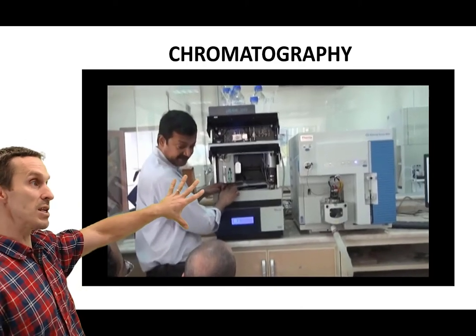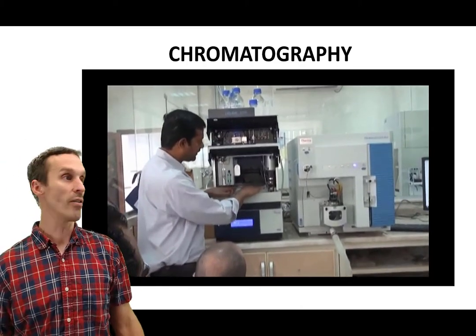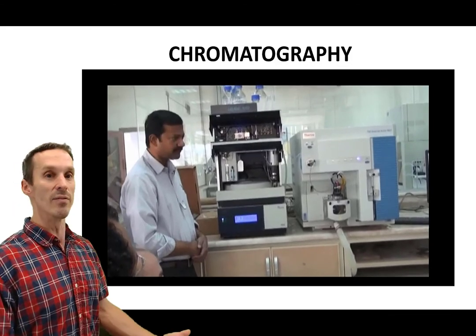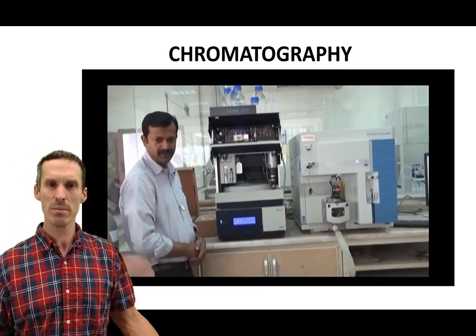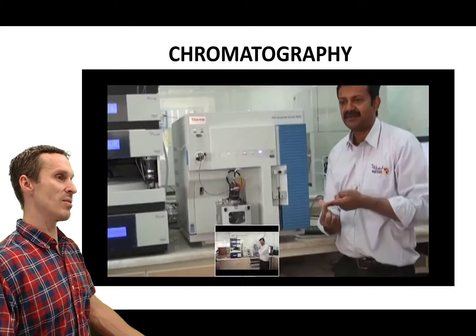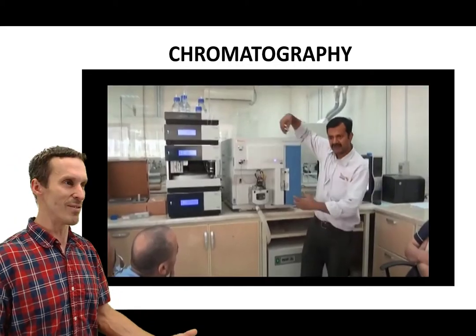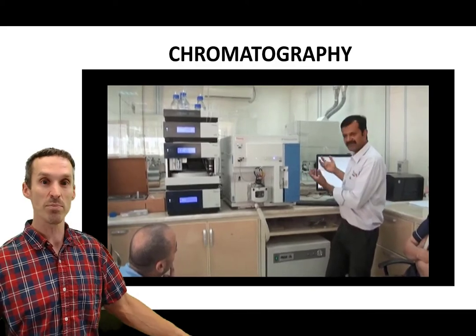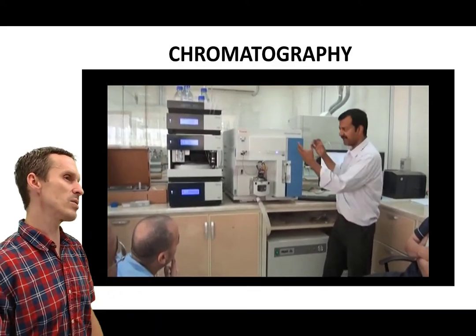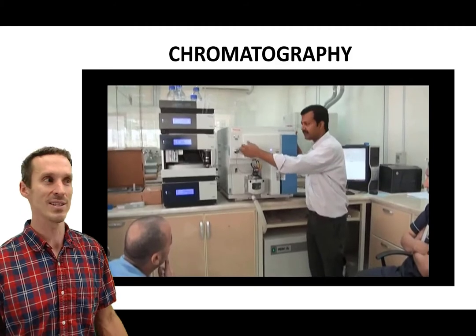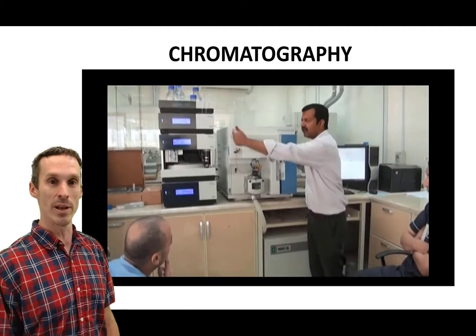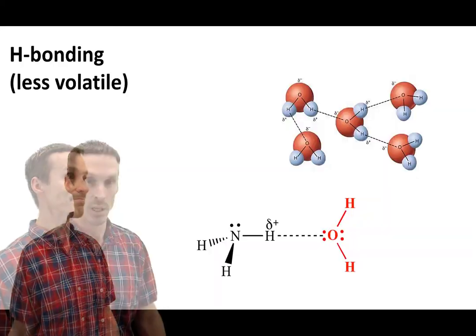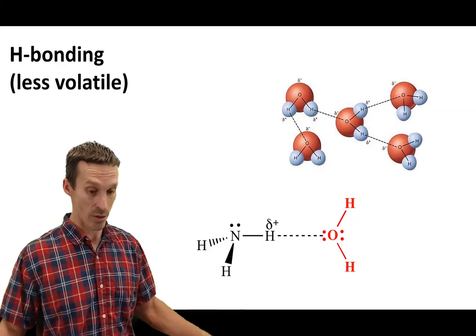Now you're seeing a coupling between HPLC and mass spectrometry on the far end. Just to demonstrate how the scale of these things might look, these are pretty big benchtop instruments. We say they're like microwave or dishwasher size. What's underneath the bench there is important—that's the pumping mechanisms, because all of this is under vacuum. These are pretty hefty instruments. They take a fair amount of bench space and a lot of training to get really good at using them. There you go, that was a quick tour of GC and LC.